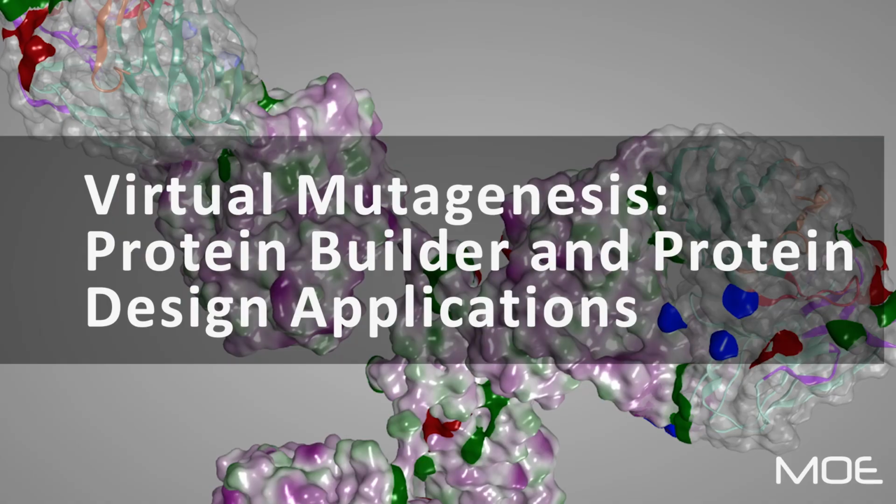Today I'd like to show you how to make virtual mutations, and we'll do this using two different approaches. The first, using Protein Builder, which is a good application for making a single point mutation. The second is using Protein Design, which is a good application for making multiple mutations and analyzing the impact of those mutations upon affinity. So let's get started.